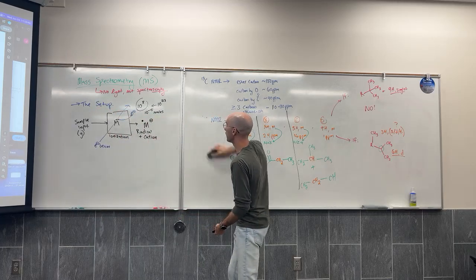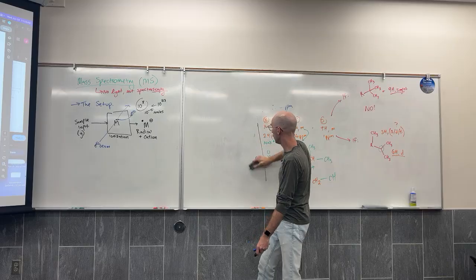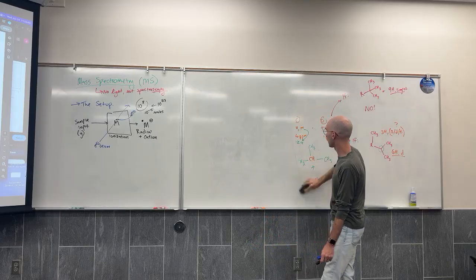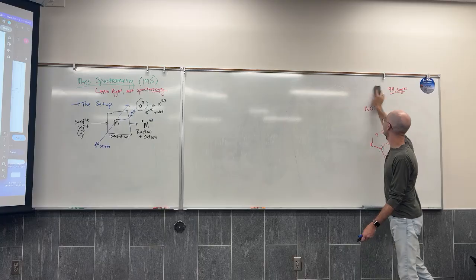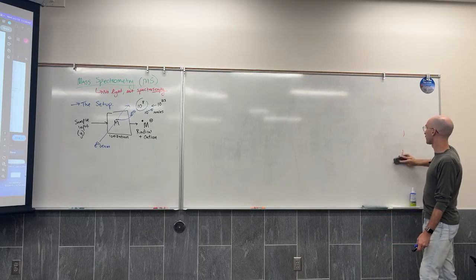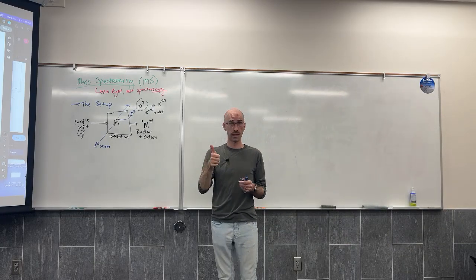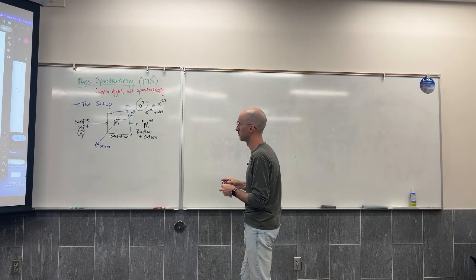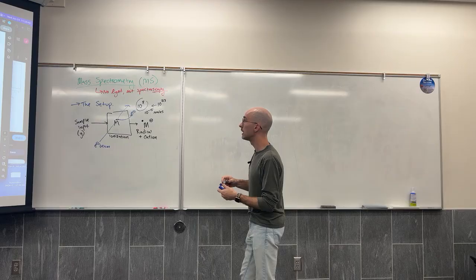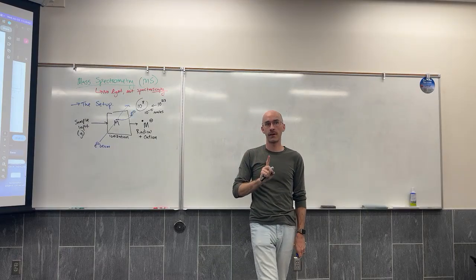So the instrumental setup starts like this. My molecule is input into the instrument where it's ionized by an electron beam to form a radical and a cation. Good with that? Quinn? It's called a radical because it lost a lone pair. Is that what it's called? No. No. It's called a radical because it has an unpaired electron.